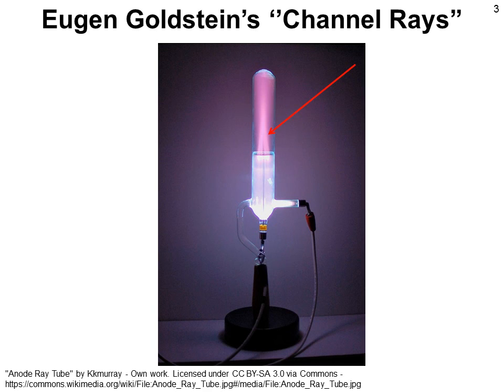Every gas contains a low amount of ions initially due to cosmic radiation. These ions are then accelerated and collide with gas atoms, generating more ions by knocking off electrons. Ultimately, this leads to many excited ions that are accelerated, pass through the cathode, and emit their energy partially in the form of fluorescence. This can be then seen as the so-called Kanalstrahlen or channel rays.